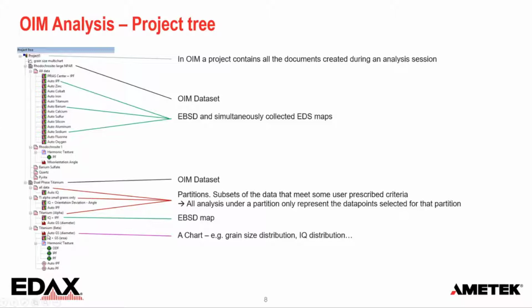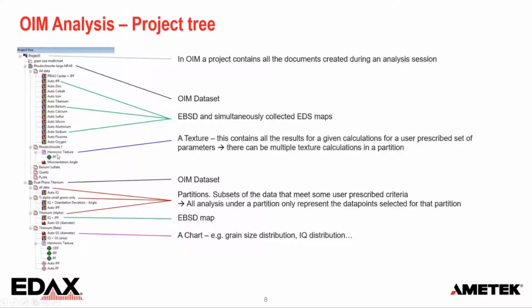Of course, you can also do charts, as I just mentioned, where we just quantify the displays, and also many things we can't display, we can still quantify. There's a large collection of charts available. We can also make textures, and you can even make multiple textures inside a single partition. So you can calculate a texture with different parameters, just what you need to do.